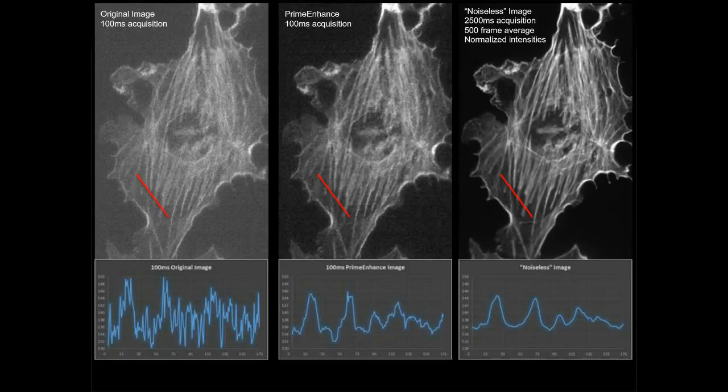are. And just as I didn't mention this, but those are the same exposures, one with the feature off, one with the feature on, and you can clearly see that you're getting better signal to noise. Now, signal to noise is measured differently by everyone. Some people do signal to background, some people signal to standard.